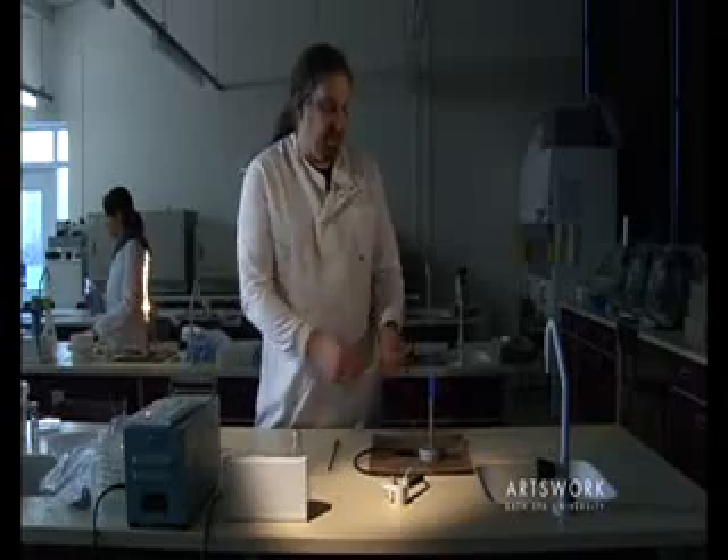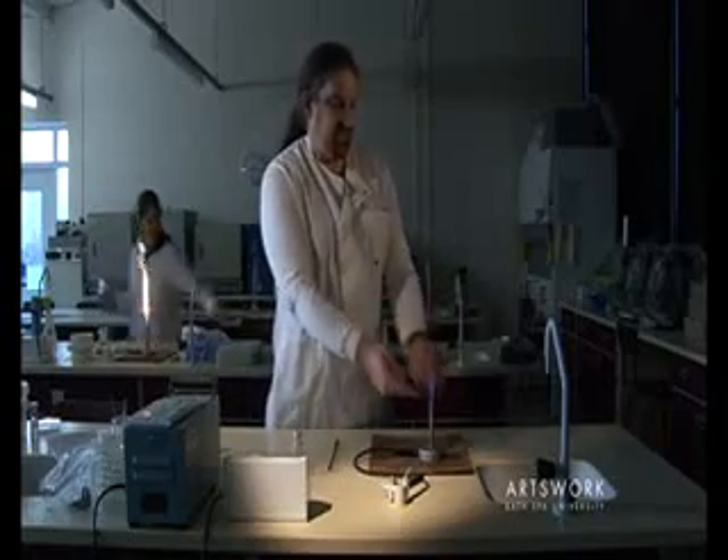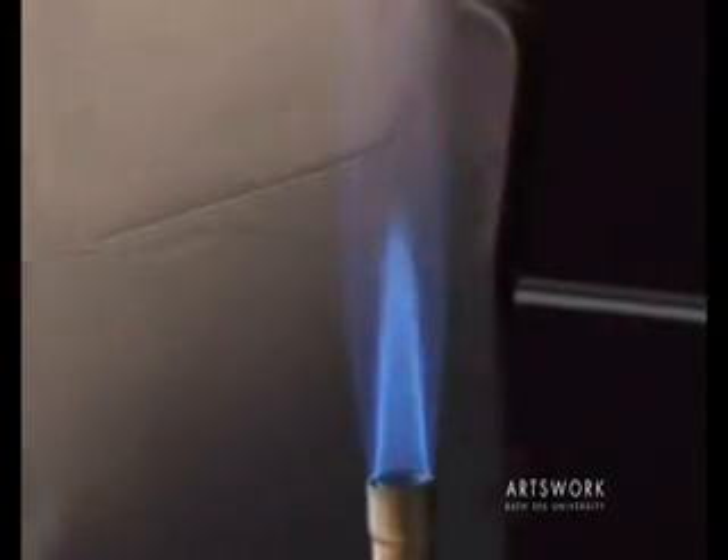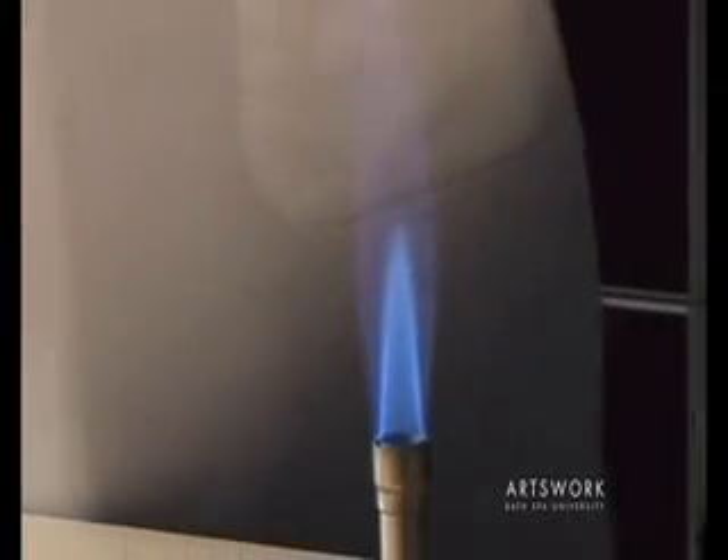If you notice the flame, you've got an outer cone of blue gas and a much smaller cone in the middle. The hottest part of that flame is at the peak of that inner cone.